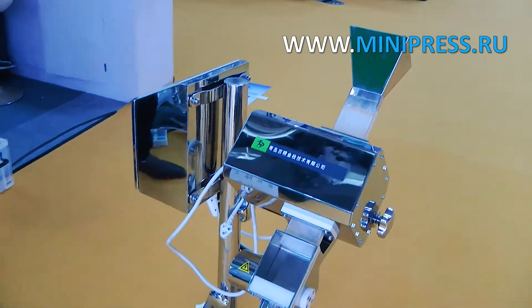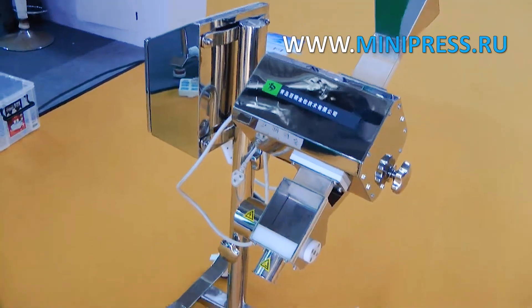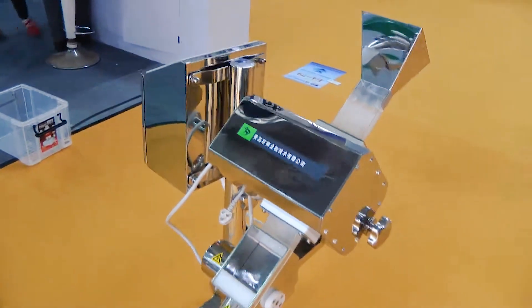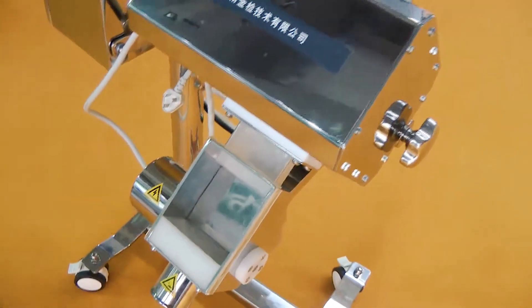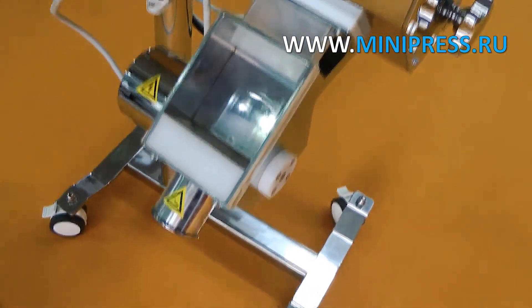It detects all magnetic and non-magnetic metal contaminants: steel, stainless steel, and aluminum, and eliminates them. Compatible with all models of tablet presses and machines for filling hard gelatin capsules, and can be used separately. Weighs 55 pounds.